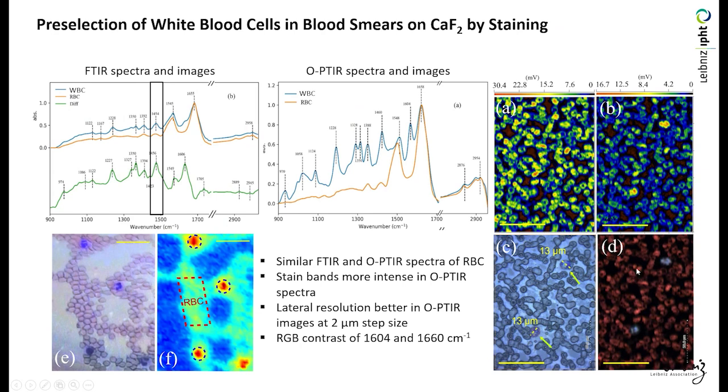The red blood cells are in the red channel, and the white blood cells are then in the blue channel.